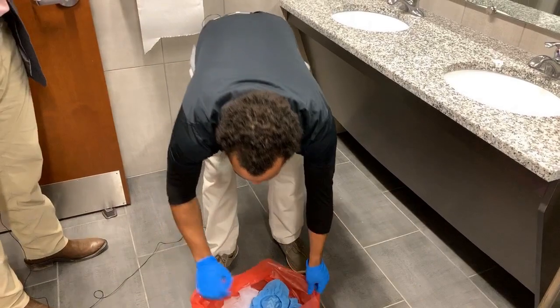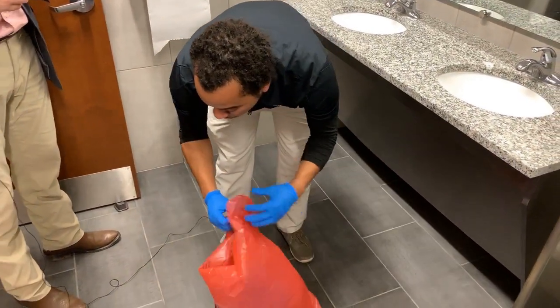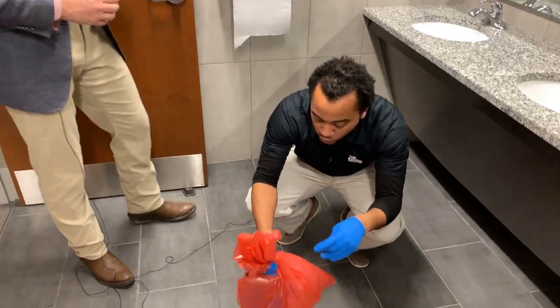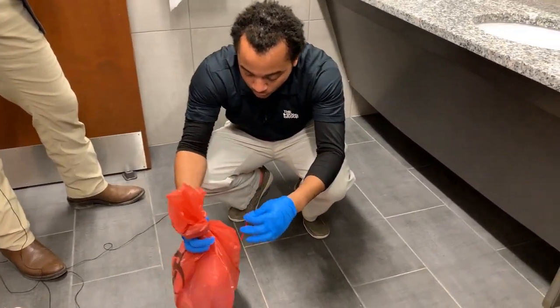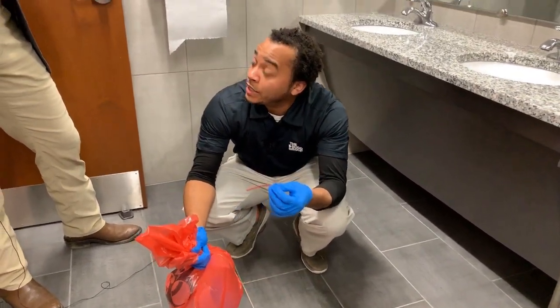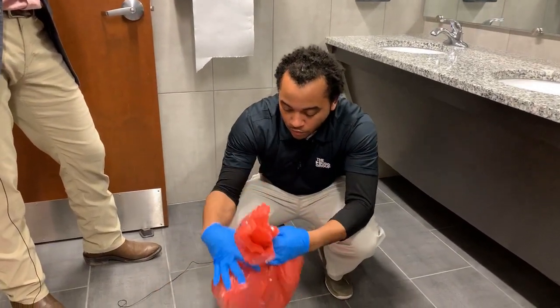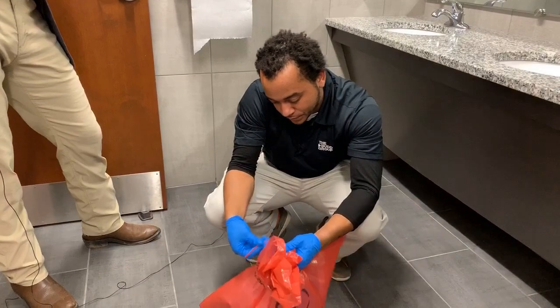Then I want to tie the contents of this bag up with the red zip ties. Thank you. And we want to make sure this is tightly sealed. The reason being, we don't want any leaks or blood coming out of the bag. So we want to make sure that we get this really tight.